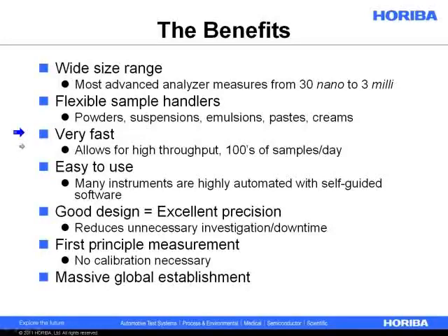Because the measurement's also very fast, you can try to do some dynamics measurements too. If you want to capture a reaction that takes a few minutes or a few hours, you can do that in laser diffraction. We have a user here in California who was studying algae growth. What he did was put the starting material in the analyzer, took a few measurements, initiated the reaction by adding some other materials, and then set up a sequence so that he got a measurement every 5 minutes for 24 hours. Over the course of a day, he can get very valuable information on how this algae is growing.